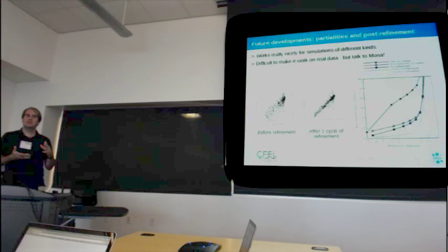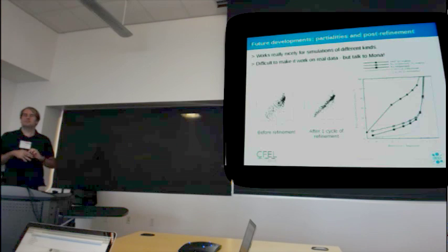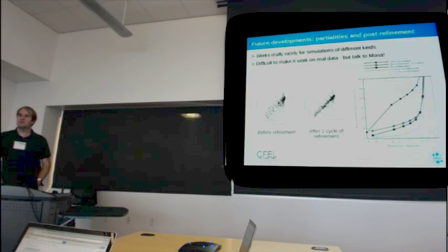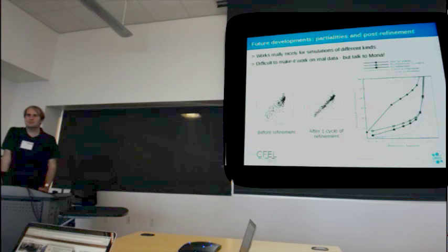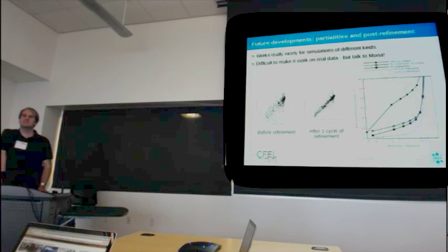Then you multiply the partialities by the intensities, and there's also a scaling factor, to give you a partial intensity. That then goes in the stream. So for each cycle, you take the intensity corrected for partiality and take the average, and that would be the temporary reference. Yes, that's exactly how it works. There's no external reference. Does that answer your question?